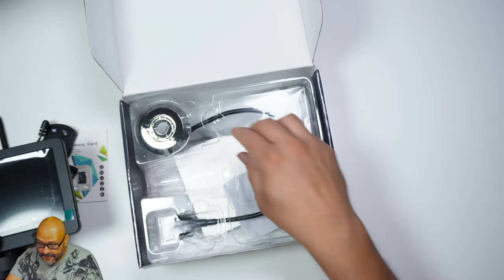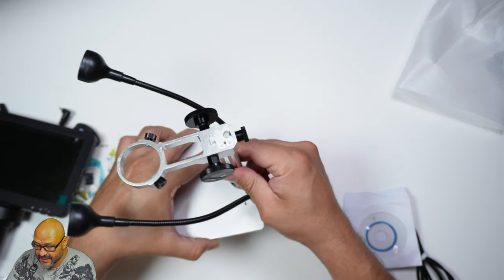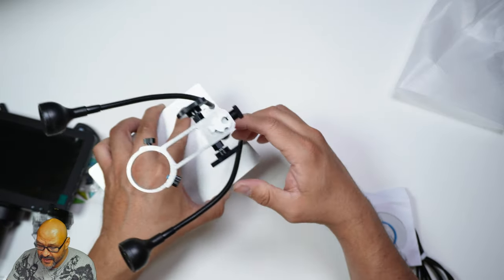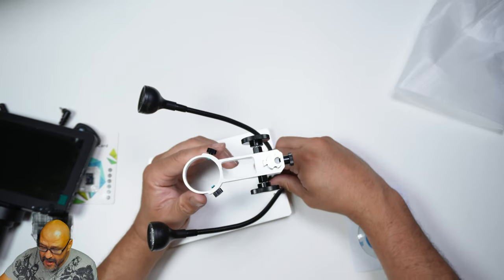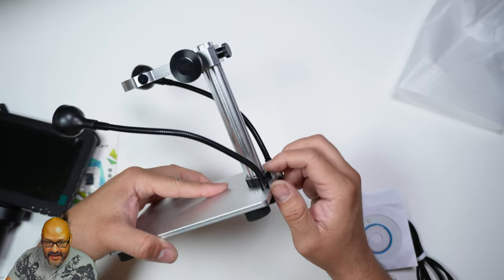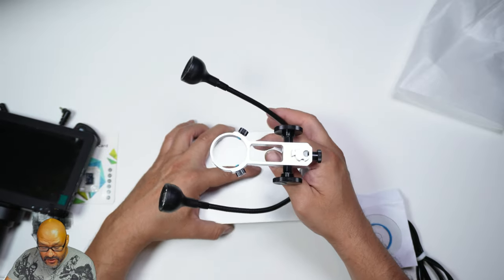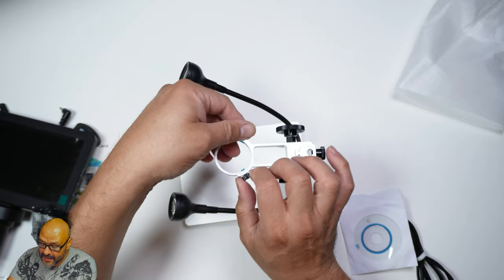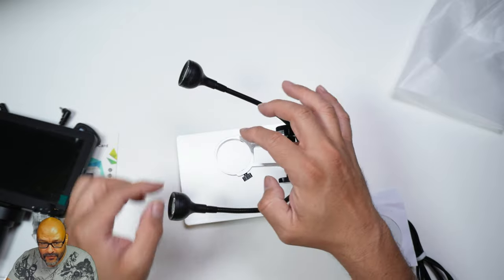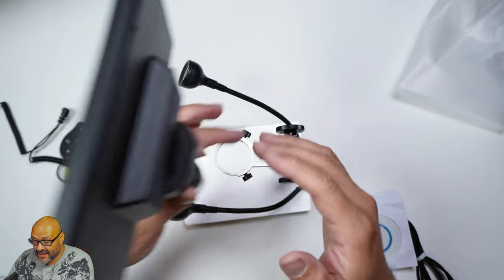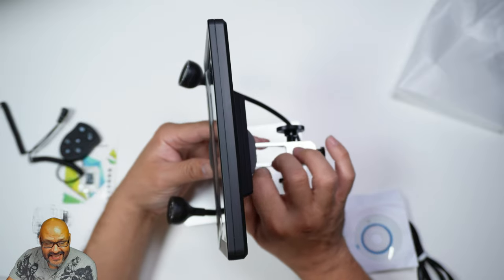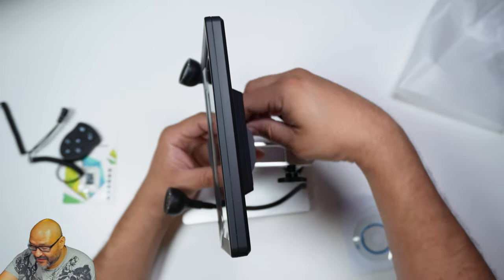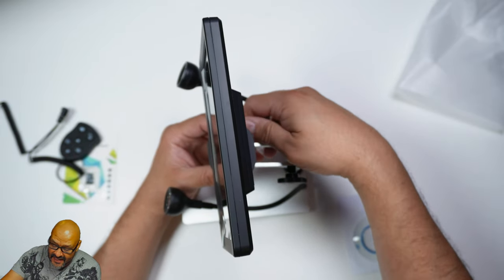Assembly is pretty easy. You rotate this until you get it to a nice degree. Then once you get it down, you can tighten the bottom up to fit it in there. Once you get it to a point that you have it open, the two little screws in here, all you got to do is drop this in there and then fasten it. Once you got it fastened and you don't have to move it, the screen is set up.